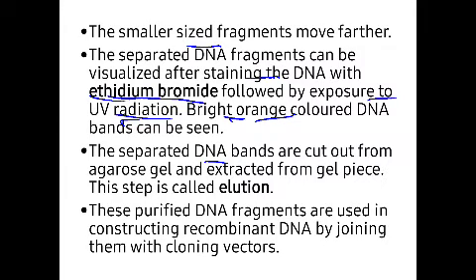After that, the DNA bands are separated, and they will be cut out from the agarose gel. The gel is the medium, and the DNA will be cut out and extracted from the gel piece. This step is known as elution.